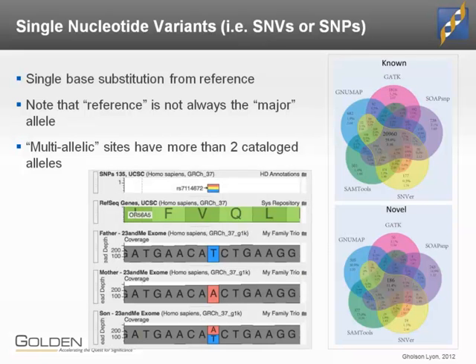One last note on variant callers. This is an example from Gabe, our product development VP. He had himself, his wife, and their child sequenced through the 23andMe pilot program for exomes, and found a number of interesting things as he reviewed the data.